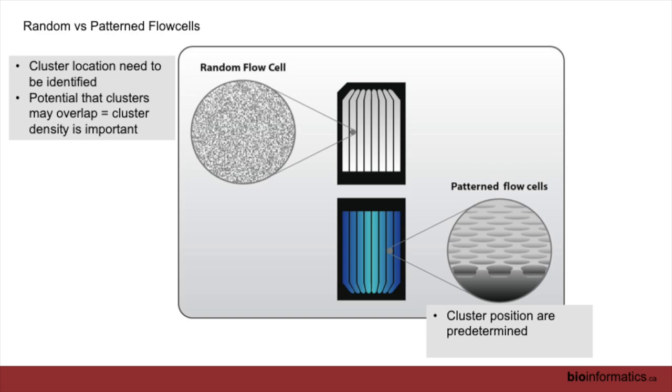So it's very important to have the correct cluster density. You don't want too dense of an overlay of clusters, because you'll run into problems trying to identify them from each other. You don't want it too sparse either, because you're just wasting real estate on that slide.